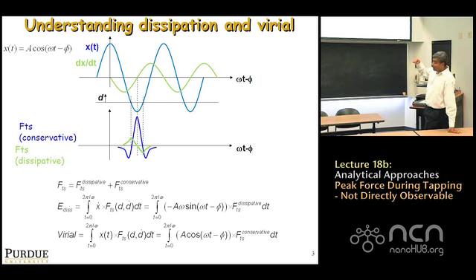And when x becomes negative and goes down is when it's approaching the sample, right? So what you're looking at is this motion, up and down. While that's going on, you can also plot in green on the top graph what the velocity of the tip is doing. If you assume the tip displacement is a cosine omega t minus phi, the tip velocity is going to be negative a omega sine omega t minus phi, okay? Which is plotted in green, right?